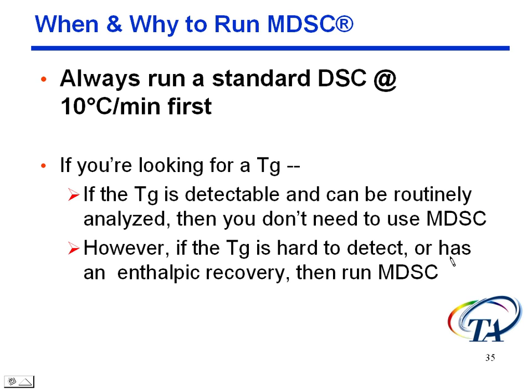When and why would you want to run modulated DSC? Now, I've had customers say, well, I've got a modulated DSC, so should I just run that for everything? And my answer is no. I would always run a standard DSC first, average maybe 10 degrees a minute.